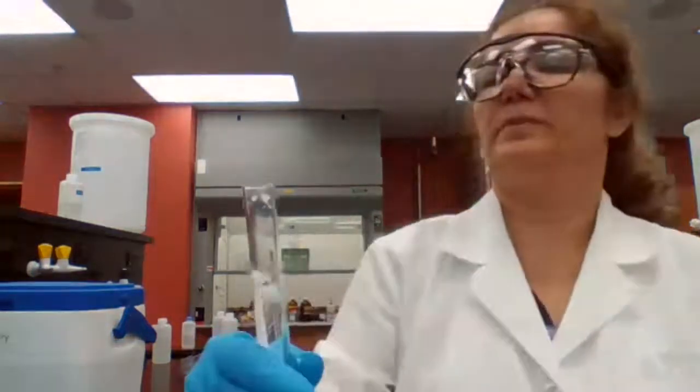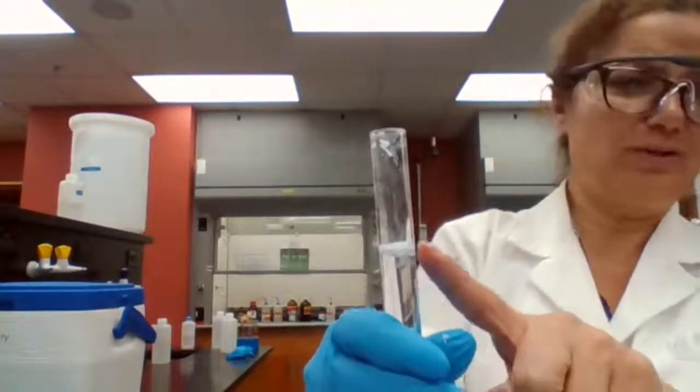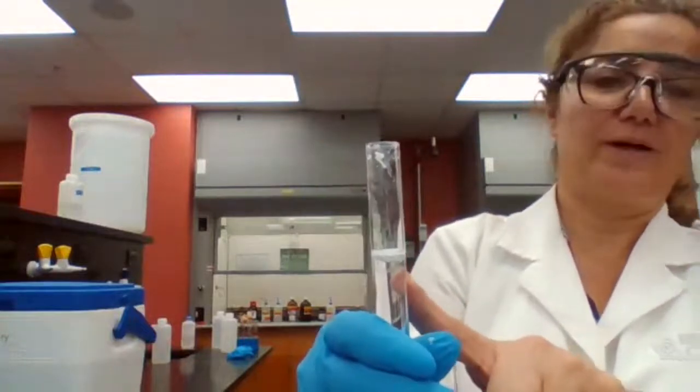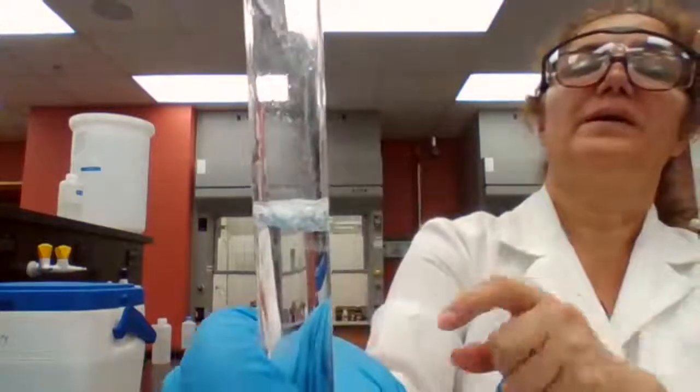The sample for sodium bicarbonate has not dissolved yet, but is much less than what I started with. I put a little too much acid for sodium bicarbonate because I wanted to see a faster reaction. So you could see the bubbles are forming.